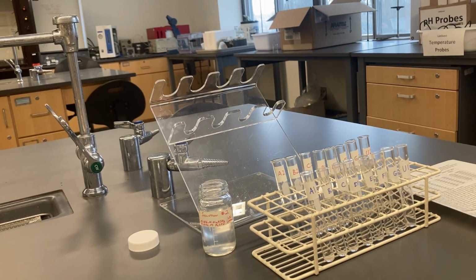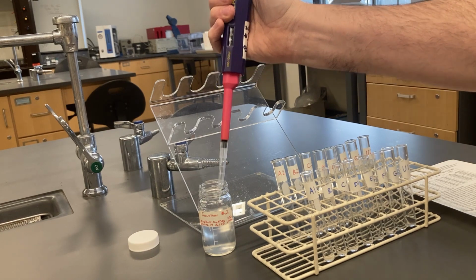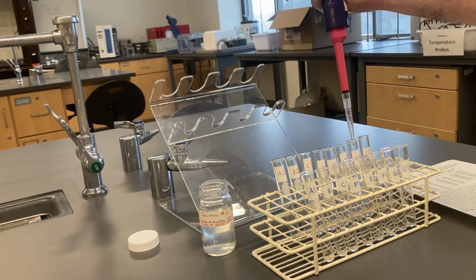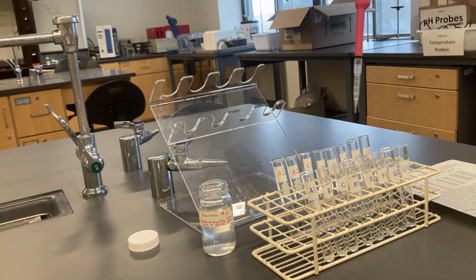And G2 and U2 also get 200, so while I'm on the 200, I'm going to put 200 in G2 and 200 in U2. Now the F2 is going to get 400 microliters.